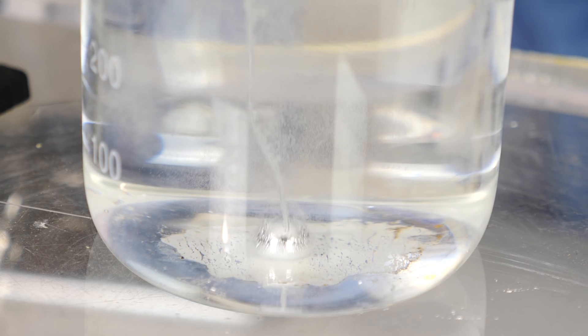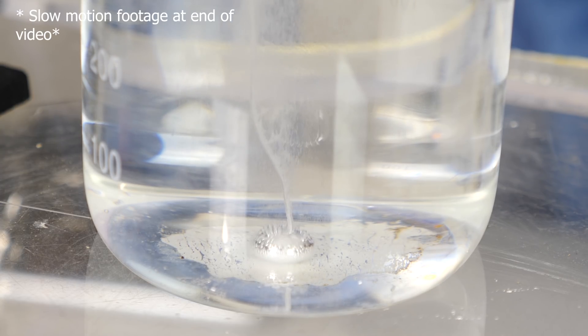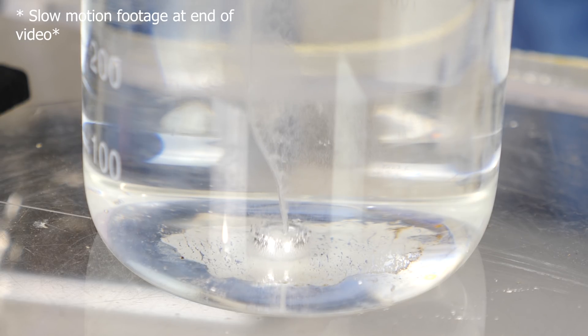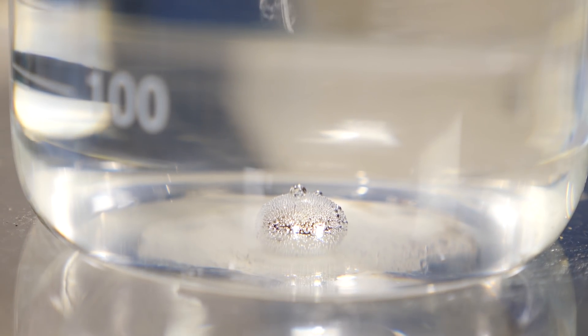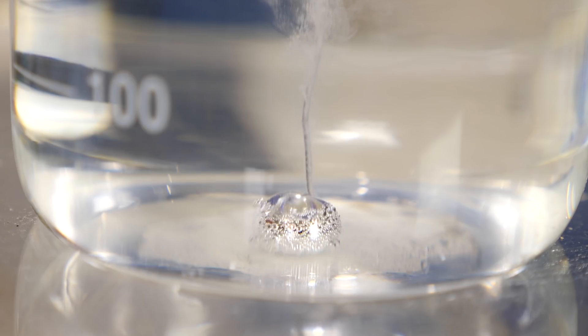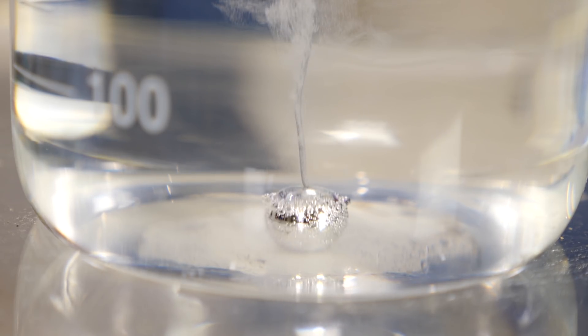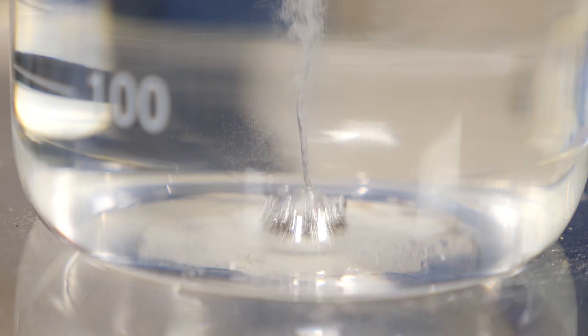Whoa, it's pulsating — look at it go back and forth like that! As soon as it touches that iron metal, it almost instantly reacts and then relaxes. And once it relaxes, it's not touching the iron anymore, so it can react with the sulfuric acid again, bead back up and rise higher. Now that it's higher it touches the iron again, so it's just pulsating back and forth.